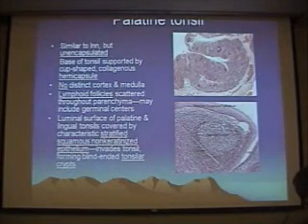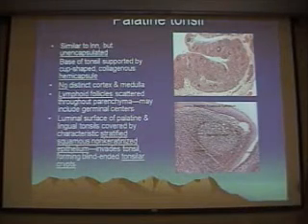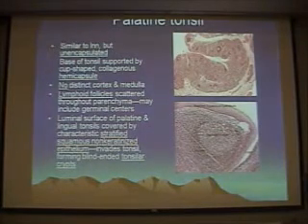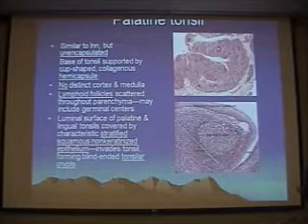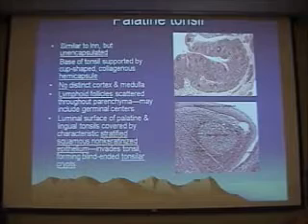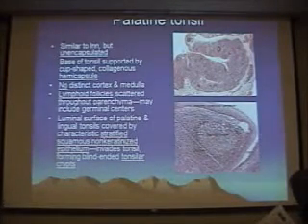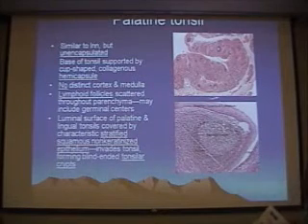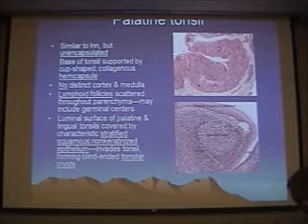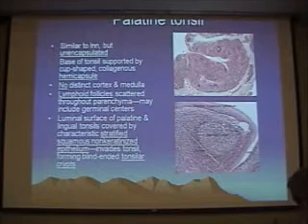The palatine tonsil, another lymphoid organ, sounds like a lymph node at first. But if you look closely, you see that on the surface of the lymph node, it has a skin-like covering. It has a stratified squamous epithelium over it. So anytime you see that thin, delicate skin-like covering, you know it's going to be a palatine tonsil. It rests in a very delicate connective tissue hemicapsule, and it often has these very thick spaces or cracks within it called tonsillar crypts.